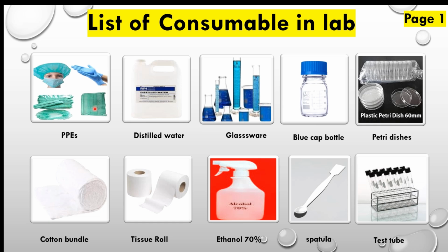This is for personal safety. And distilled water, because ISO methods claim that our distilled water should have a conductivity of 5 microsiemens per centimeter and less than 1,000 CFU per ml as the maximum allowable limit. And others are the glasswares, which include different glasswares.